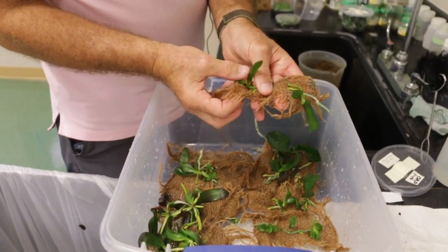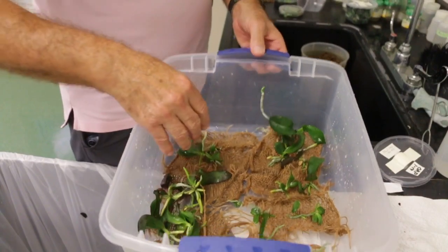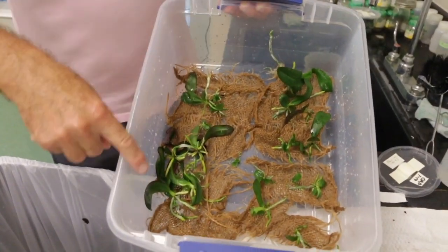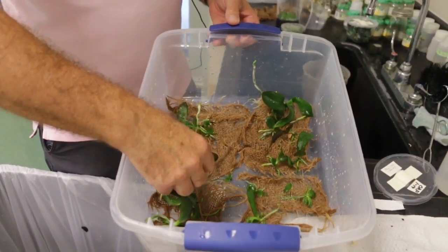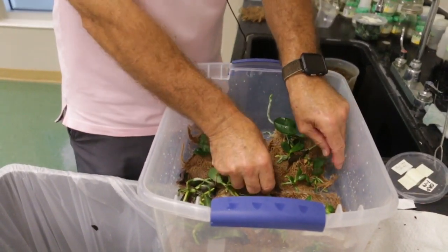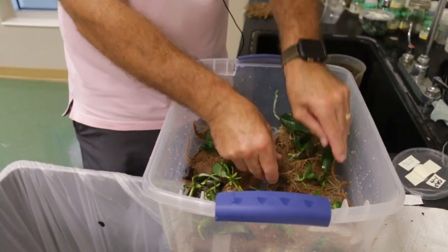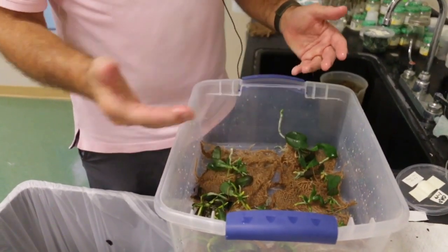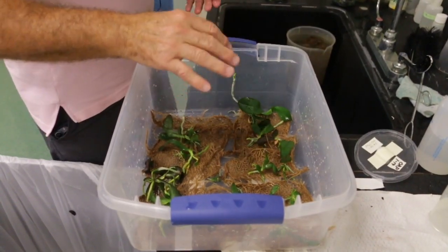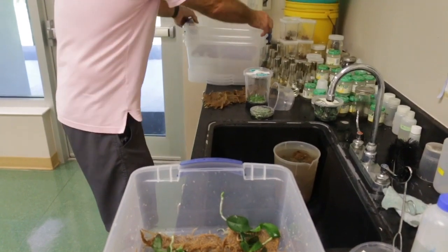Okay, so again, what we have here, and I might have to go back and straighten some of these guys out and put some more roots in. So we've got these that have been kind of distributed not as well as I'd like, so I may go back and make sure the roots are shoved in, and these are just sitting on the top. That's another big one. Oh my gosh. So from the 1 flask, we probably ended up with 10 of these ribbons of burlap that are going to have phals on them, and they grow literally quickly from week to week. So I think that by next week we'll see some roots growing out of the base and they'll do well. I'm going to go back and do these, but I want to put these on the side and then go back and show you the other orchid that we're going to deflask onto the burlap.